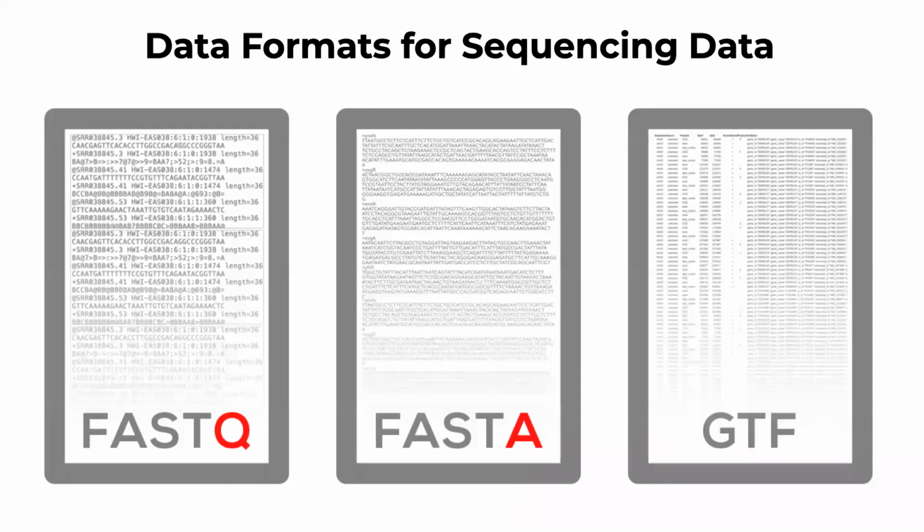Right, so it's not just for small sequences, these are short reads, and those reads do contain an additional level of information, which is called the quality score, because we have a specific quality of each individual nucleotide. So typically FASTQ files are used to capture information about reads, which is the raw data coming out of the sequencer, and FASTA is an assembled sequence of the full reference genome. Yep, reference genome and its continuous sequence.